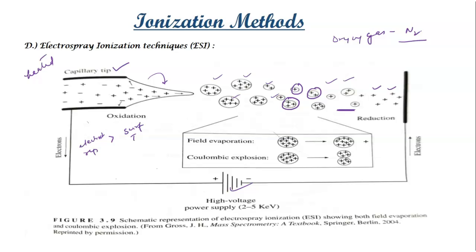Over here, your electrostatic potential is used for the formation of charged droplets, and over there in thermospray ionization, a heated capillary is used. Understanding the difference between the two? So that is the thing what is happening over here. See the next slide.